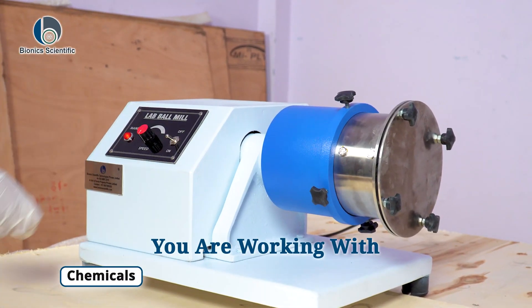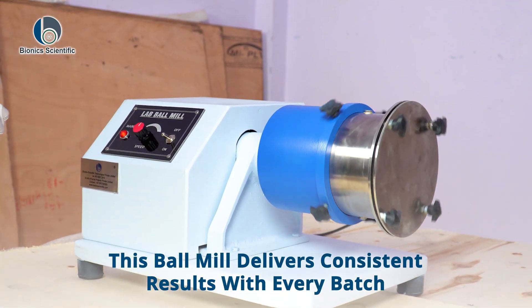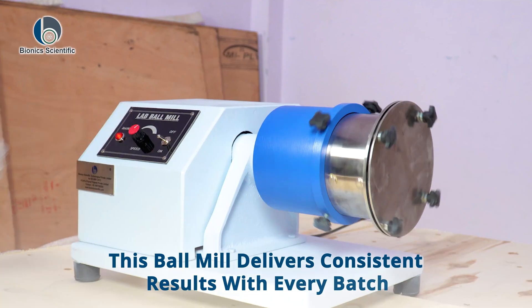Whether you are working with chemicals, ceramics, or minerals, this ball mill delivers consistent results with every batch.